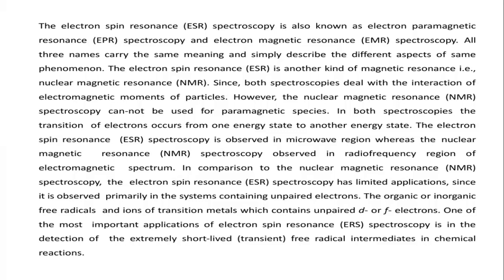One of the most important applications of ESR is the detection of extremely short-lived free radical intermediates formed in the intermediate stage of a chemical reaction.